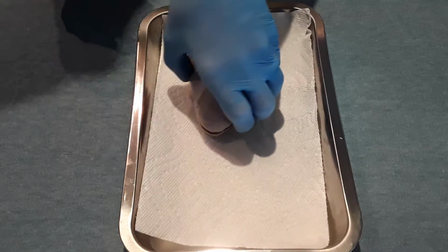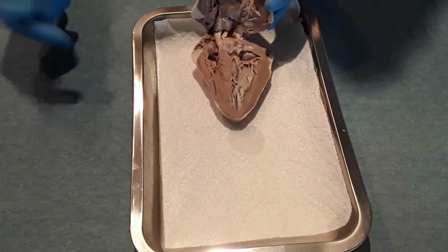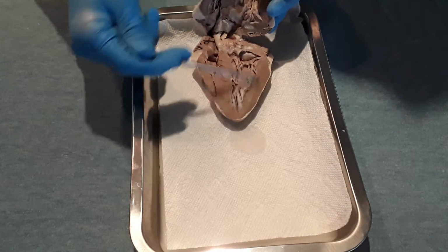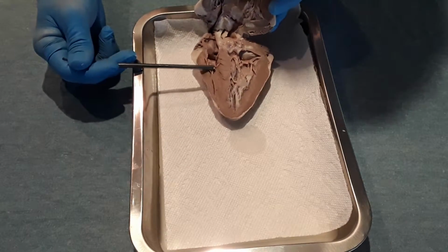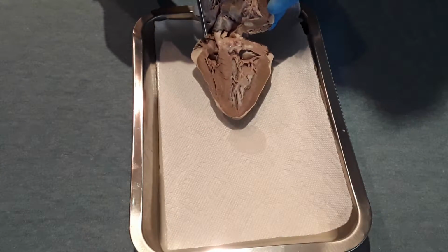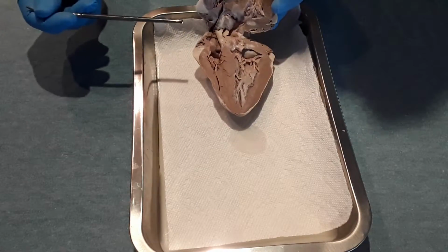And we'll open the heart up a bit. Again, this is the left ventricle, with thick heart walls, or cardiac muscle walls. This is the right ventricle, a little smaller wall on this side. Above it you have the right atrium. The left atrium is up in here.